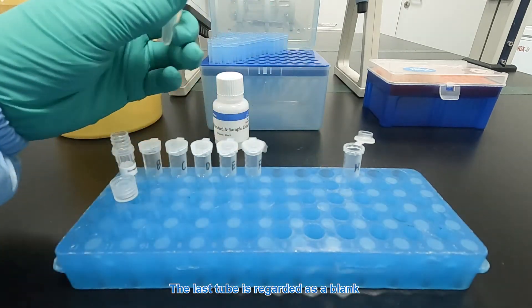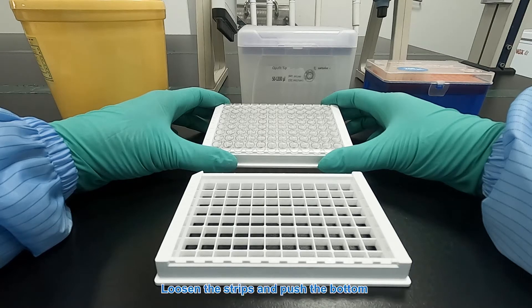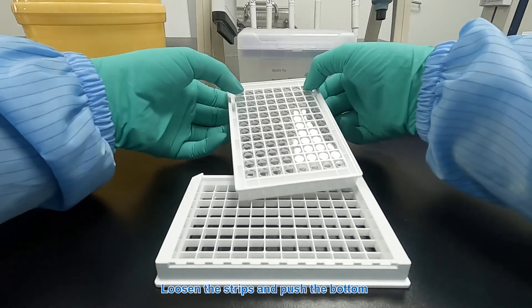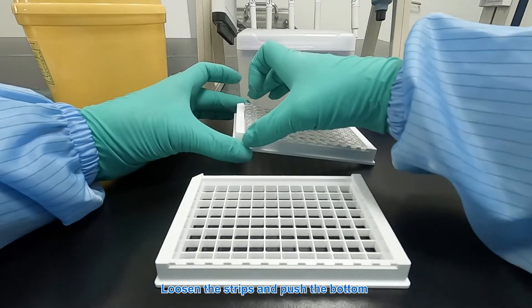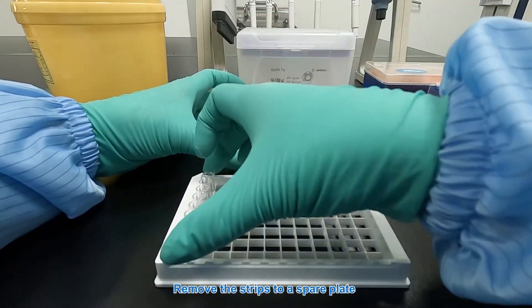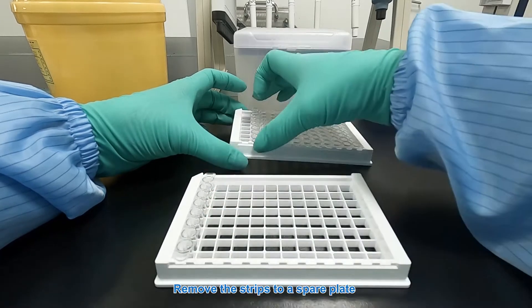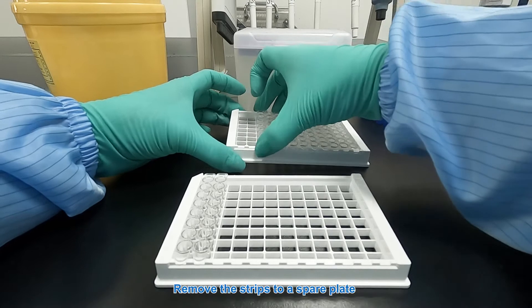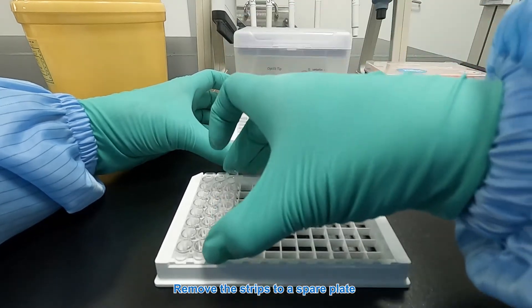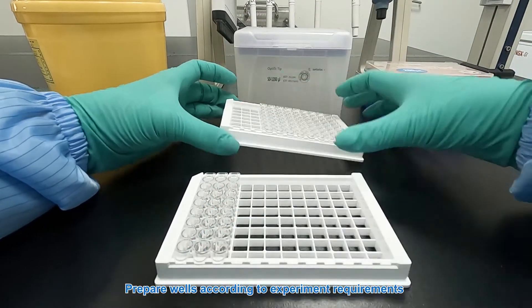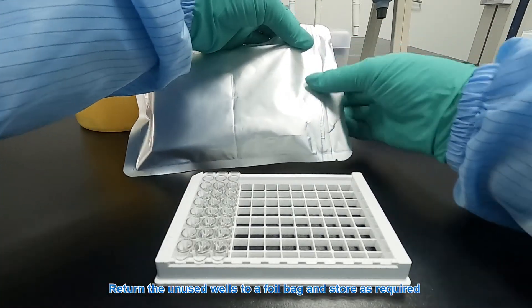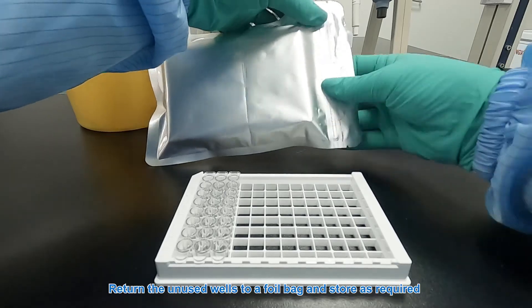The last two is regarded as a blank. Loosen the strips and push to the bottom. Remove the strips to a spare plate. Prepare wells according to the experiment requirements. Return the unused wells to a foil bag and store as required.